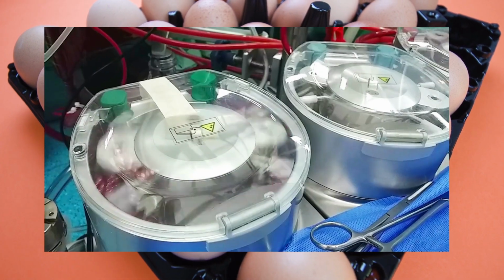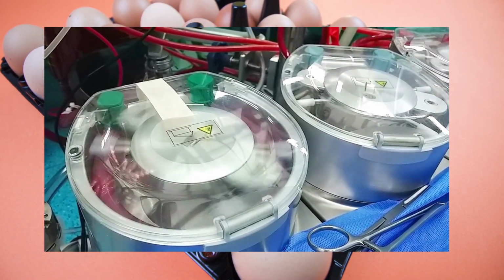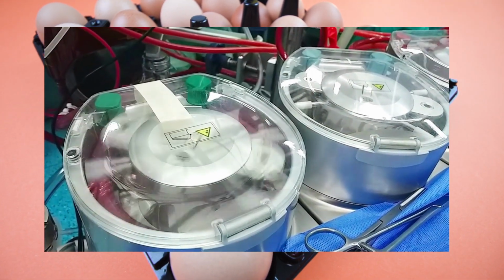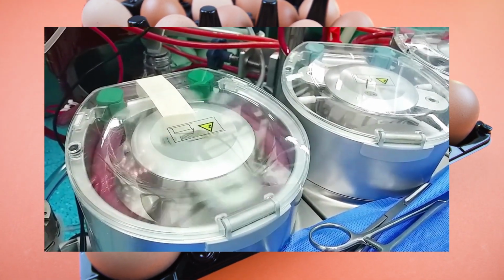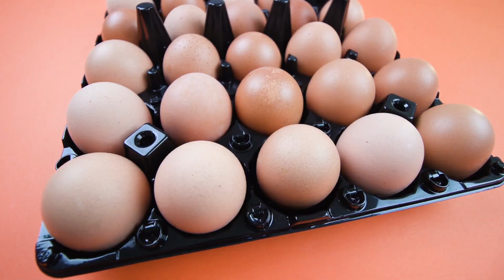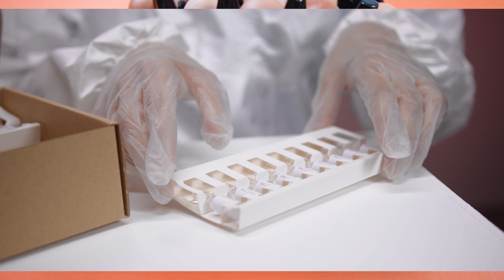What generally happens to get this concentrate is that it's put into a centrifuge, and it is spun until you can take what is the bulk of the material extracted from the eggs and separate out the part that is virus and the part that is not virus. From here, you should wind up with a small band of material in the centrifuge tube. This is generally separated from everything else with sucrose. By having this separation, you can extract everything that's unwanted and everything that is wanted.